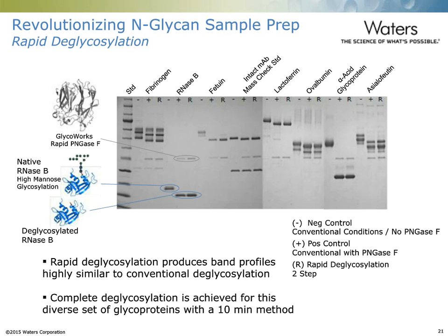This gel image provides the results of this study, where it can be seen that for each of the tested proteins, there is a significant decrease in protein apparent molecular weight after they have been subjected to rapid deglycosylation.